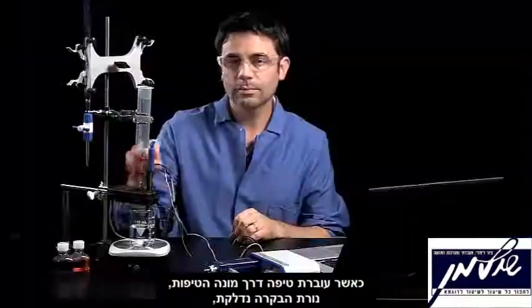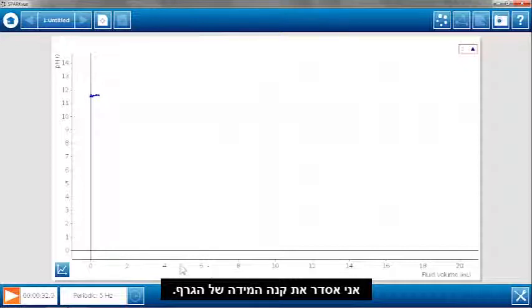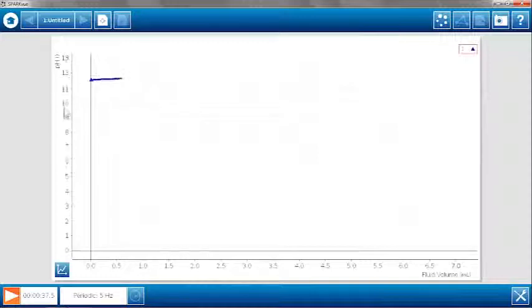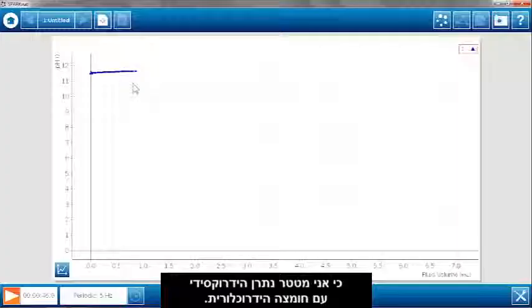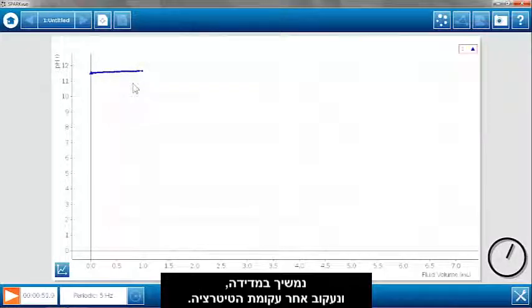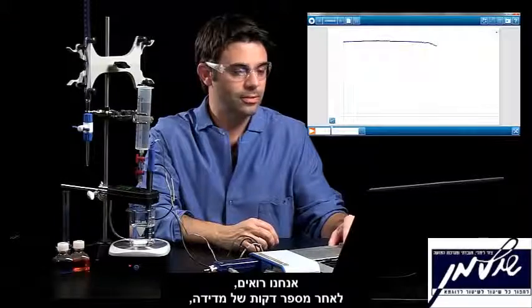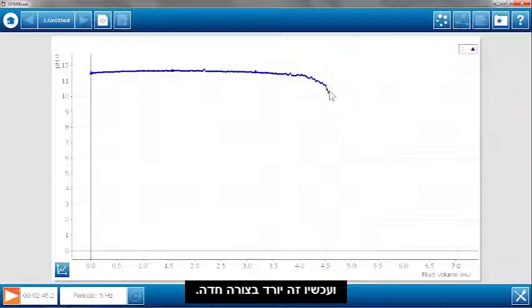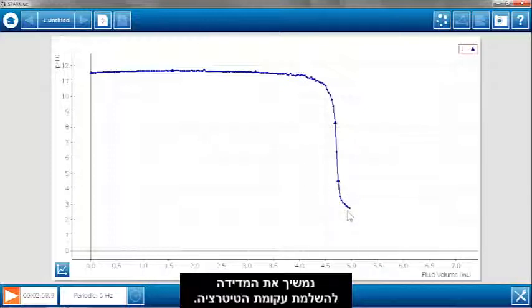As a drop goes through, the LED light in here blinks so that you know a drop is being collected. Here's my initial pH — very high because I'm titrating sodium hydroxide with hydrochloric acid. We can see after a couple of minutes the pH is starting to gradually go down, and now it's going down steeper. Now we see those big drops in pH that are indicative of the equivalence point being reached.